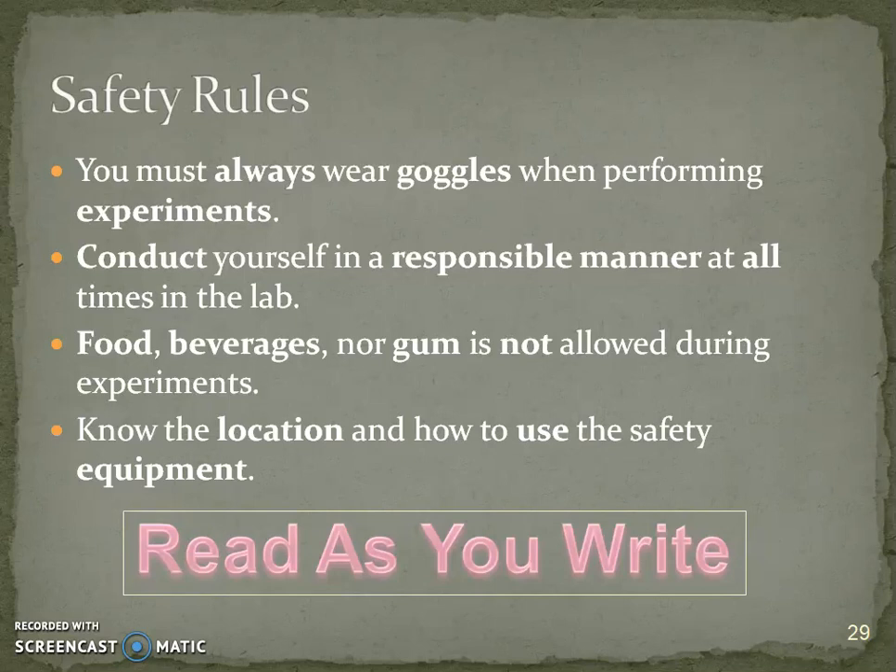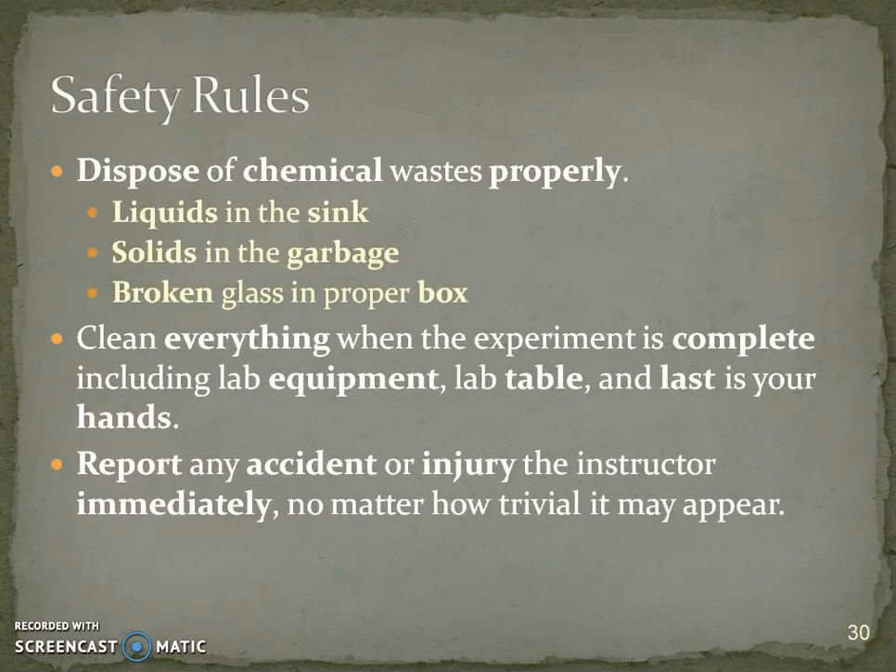Of course you're always going to be wearing goggles. You always need to behave in a responsible manner because I want everybody safe. No food, beverages, or gum because of fumes and dust particles in the air. Disposal of chemicals must be done properly: almost all liquids go down the sink and almost all solids go in the garbage.